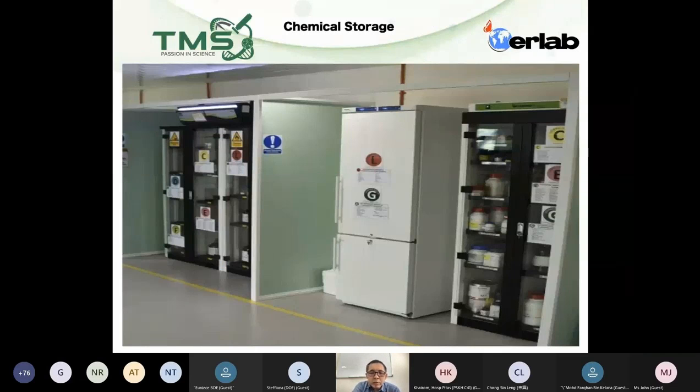This is from UTP, Universiti Teknologi Petronas. You can see that they put the L and G, the solvent and the non-intrinsic reactive solutions, in the chiller, and sometimes also in the storage cabinet. And the rest, you can see they put properly, like D, F, C, E, etc.